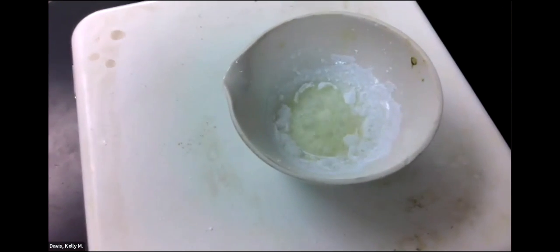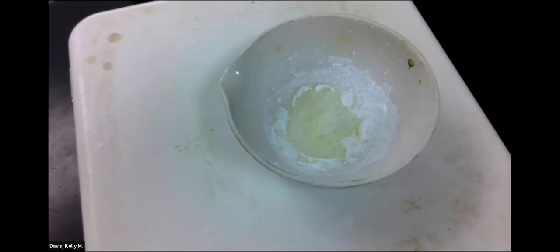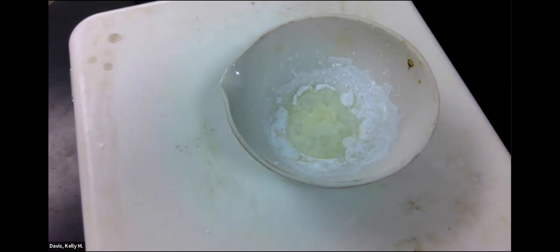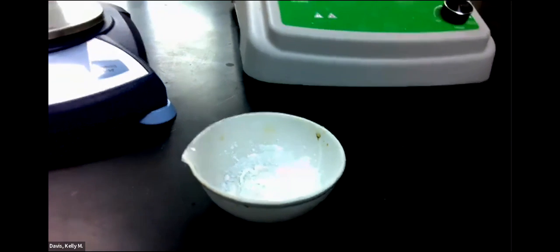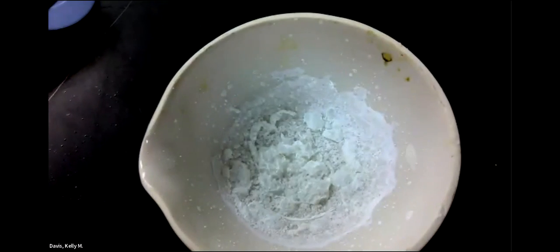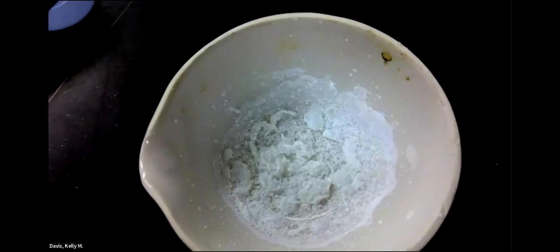Close. Let's see it. Okay, that last bit of water is evaporating there. Okay, so all the water evaporated pretty well. Let's see if I can see it. It's hard with the light shining on there. Looks pretty dry. I was starting to worry about it. All right, you can see that it looks white and crystalline, which is what we want.